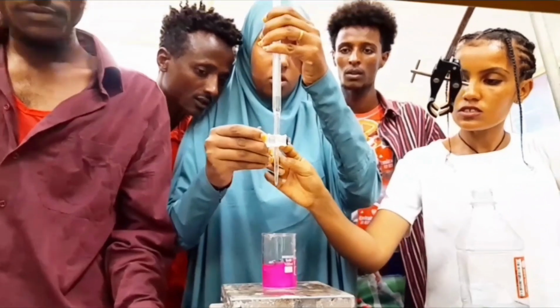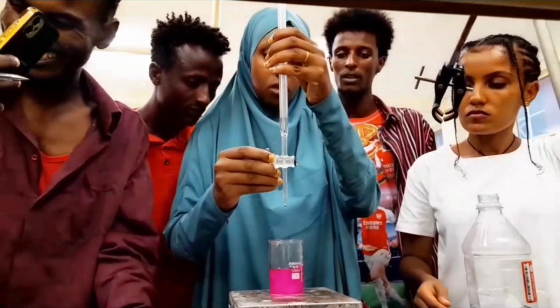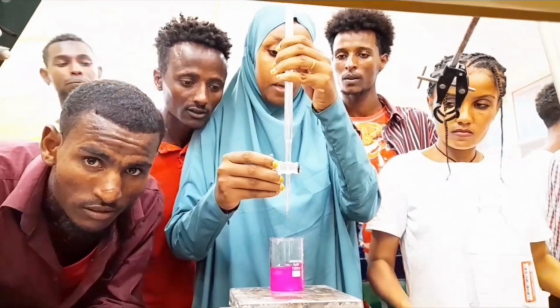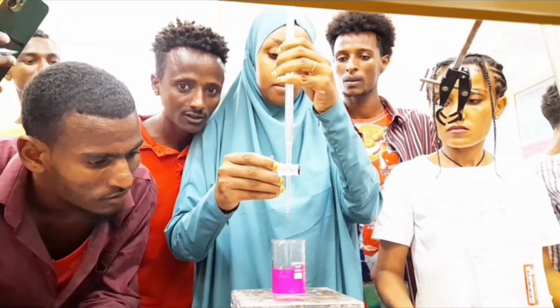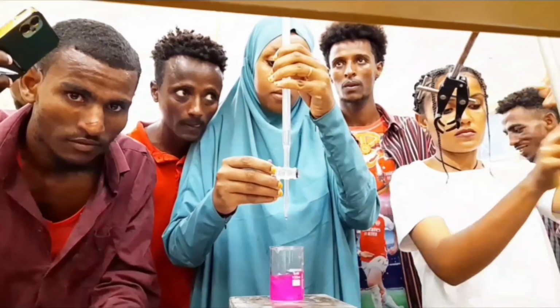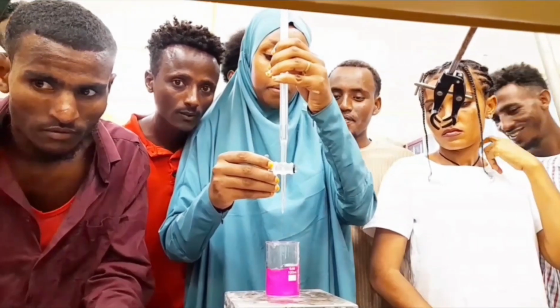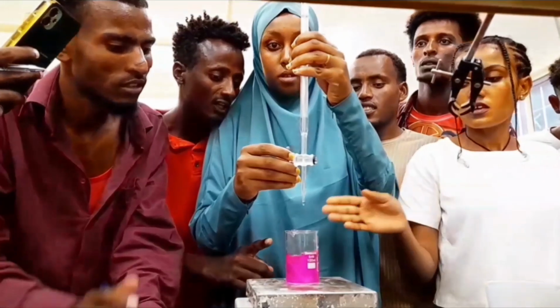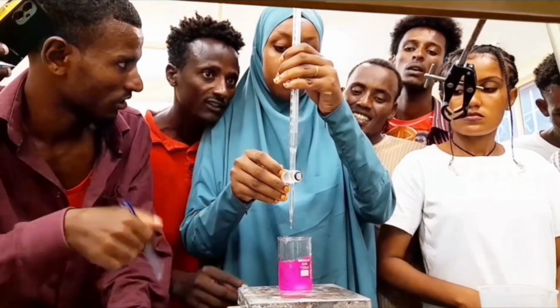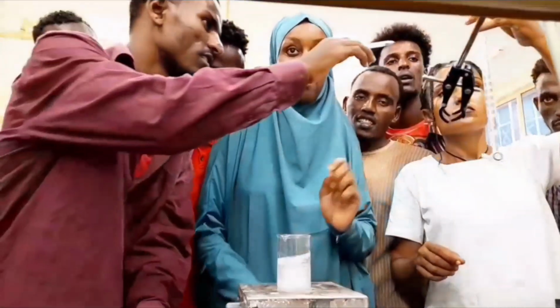Determination of mixture composition. All of you again observe the color change reaction. Now Mishara is doing it. From the burette, HCl is pouring slowly, drop by drop. The flask contains sodium chloride and sodium hydroxide. Now sodium hydroxide reacts to form sodium chloride, and the pink color changes to colorless. That is the end point. Observe the color change. Pink color changes to colorless. Slowly, slowly. Yes, see the color change. That is the end point.